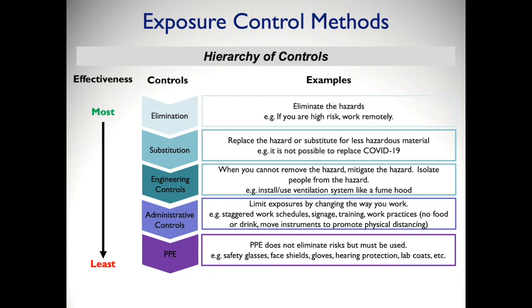The final control, and the least effective, is PPE, or personal protective equipment. While PPE does not eliminate risk, there are situations where they must be used. Examples include safety glasses, face shields, gloves, hearing protection, and lab coats.